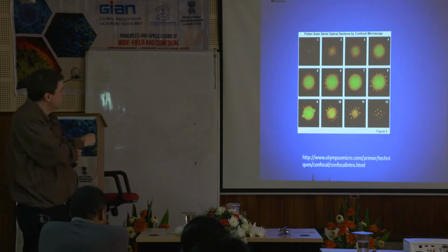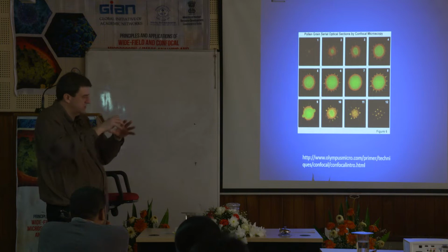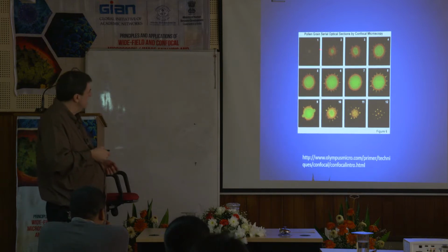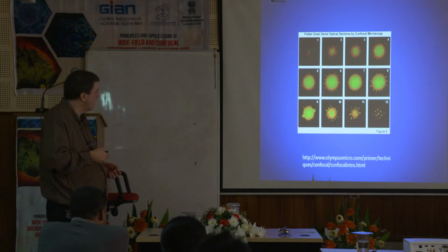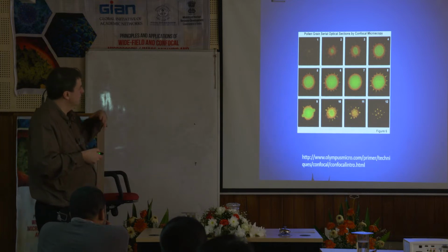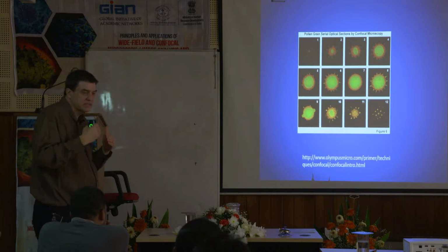Okay, so here's a classic, and hopefully we're going to try to look at this today. I actually brought a slide of a pollen grain. When you look at a pollen grain, it looks basically like a ball with a bunch of spikes coming out of it, more or less. I don't know if you've ever seen a picture of one. But here, if you use the confocal, you'd start with our deck of cards. Card number 1, the top, card number 2, card number 3, working your way in, and eventually you could build back the whole pollen grain itself without actually having to physically cut it.